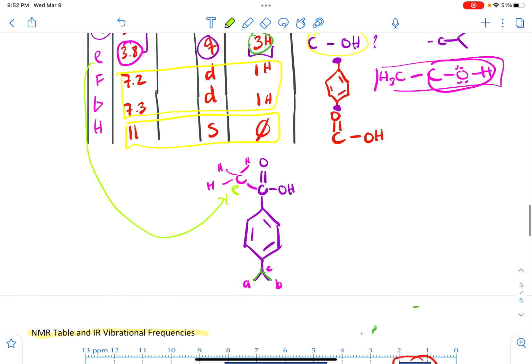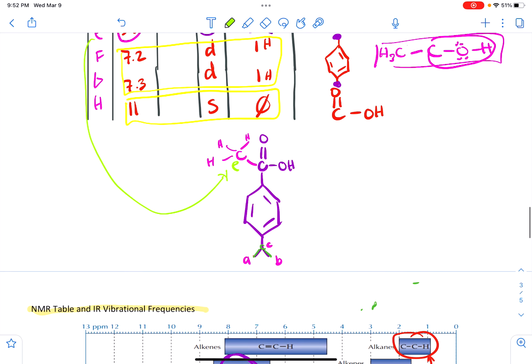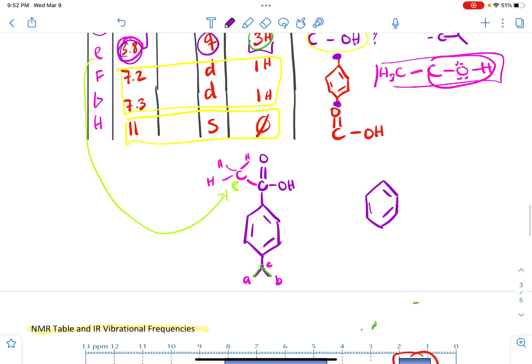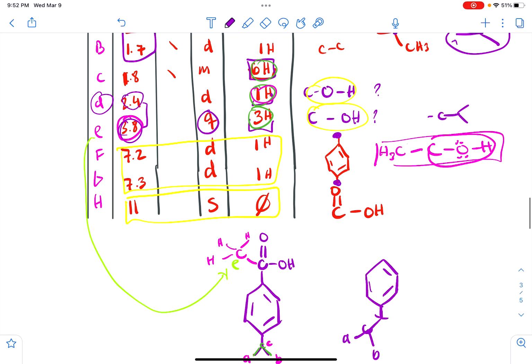And then we're going to go down because we still have to add another carbon. And so with our parabenzene, we're going to draw that ring again. And that's not how I drew before, so I'm going to draw it differently. And so we're seeing here that our 3.8 is pretty significant and our 2.4 is pretty significant. And so the 2.4, we're just going to try and add one down here and see what it looks like, because we have our carbon A, carbon B, carbon C, and we're just going to explore with this because there's going to be 2 hydrogens coming off of that.